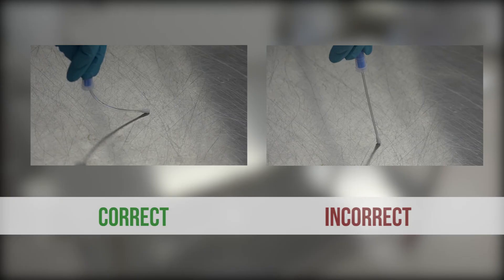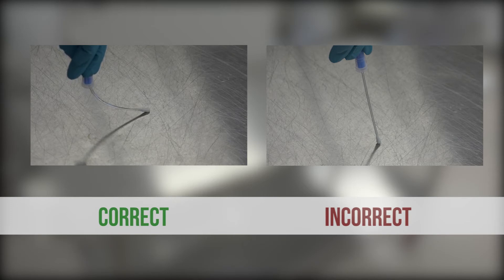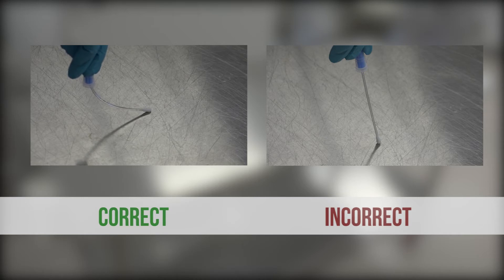Apply enough pressure to ensure flex in the swab shaft. This ensures accuracy of test results and rotate the swab to maximize sample collection.